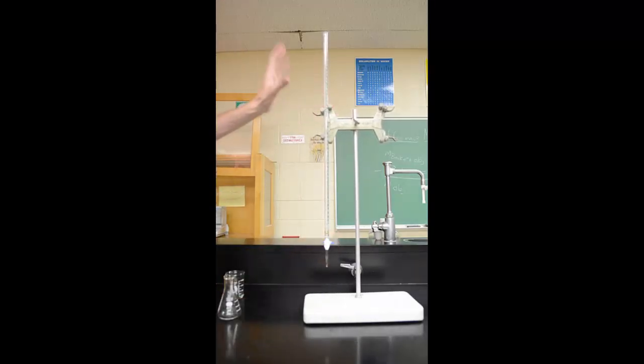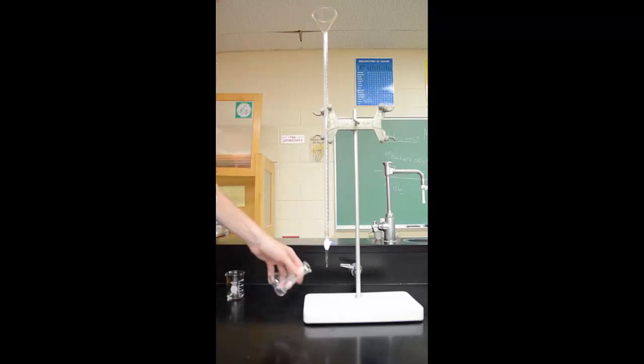Before we take any measurements at all, we're going to need two things. First, a funnel so we can put it in the top to fill it up. And second, a waste container, so anything that comes out doesn't get the base wet. It just goes right into the waste container.